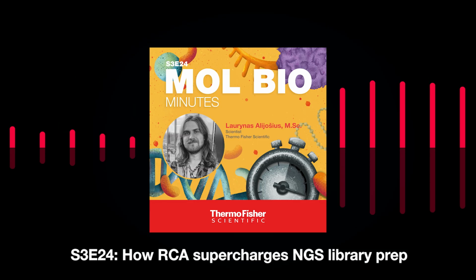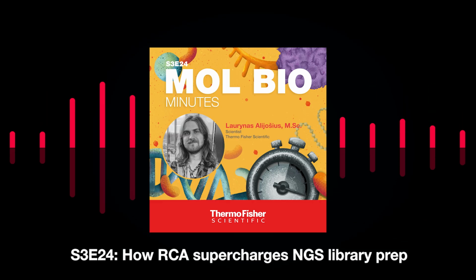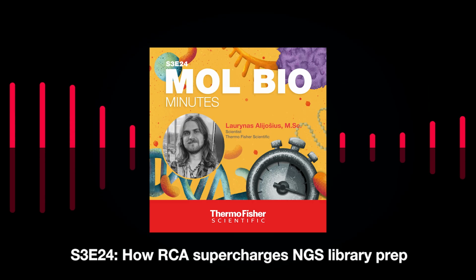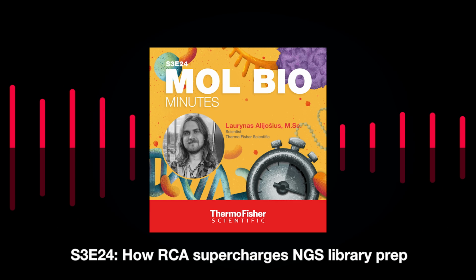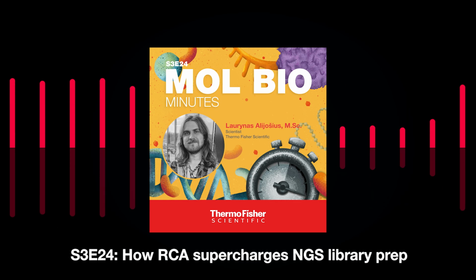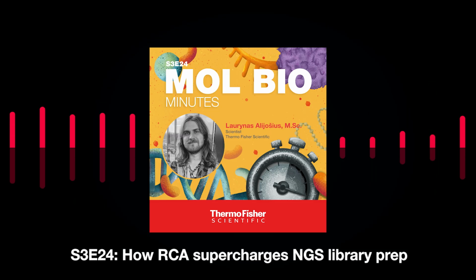So we covered the basics of how RCA can be used together with NGS applications. But what are the actual cases of RCA being used together with NGS? Let's see. RCA is often used to help in viral genomics research, especially with low abundance or difficult samples. RCA works well with circular DNA genomes as a template, or a template can be ligated into a circular DNA form and then amplified by RCA.